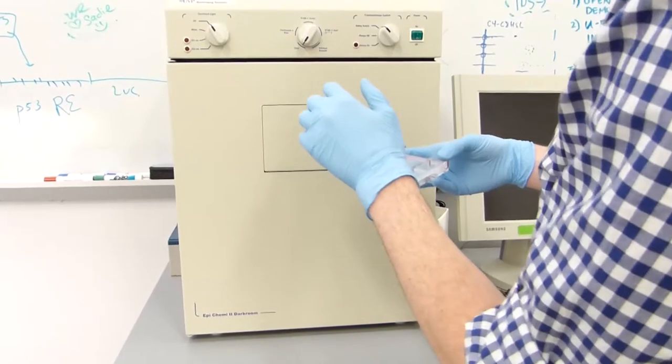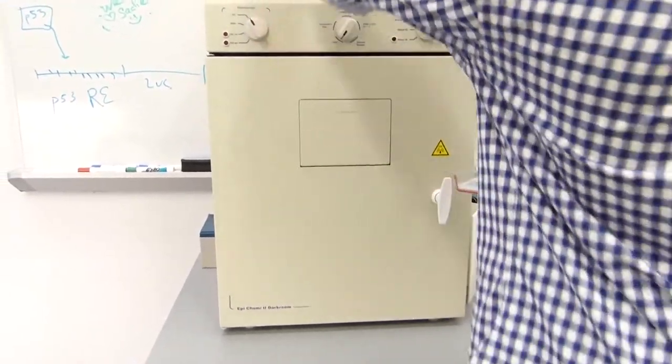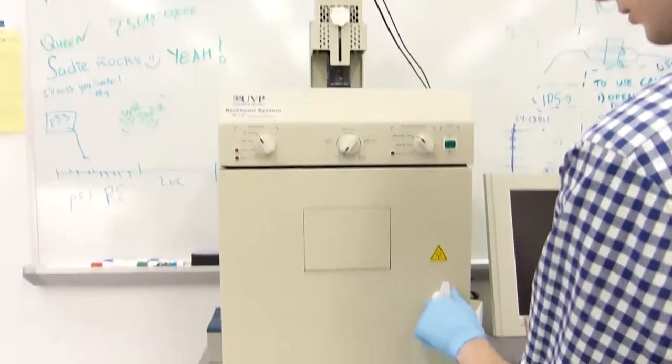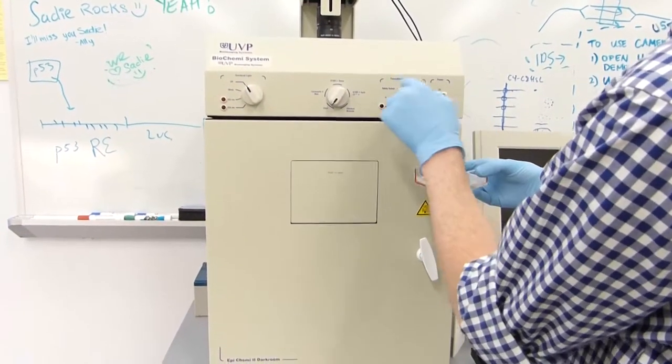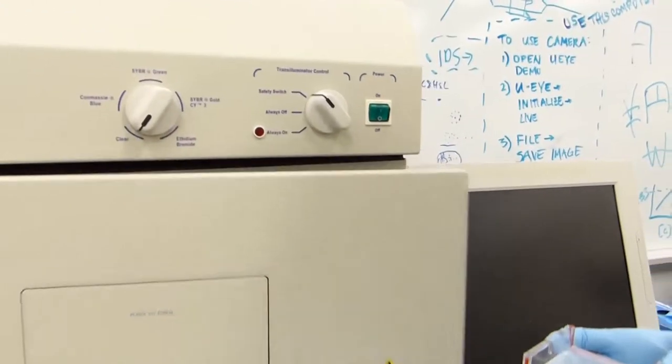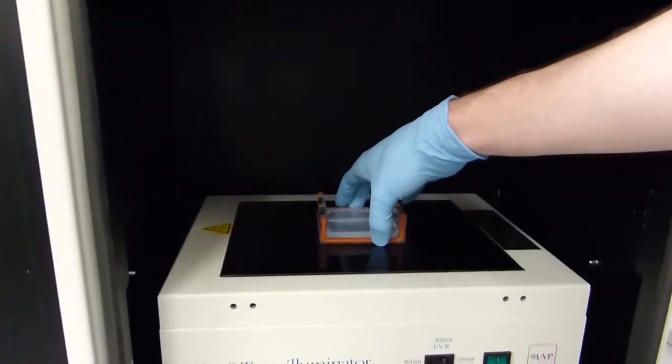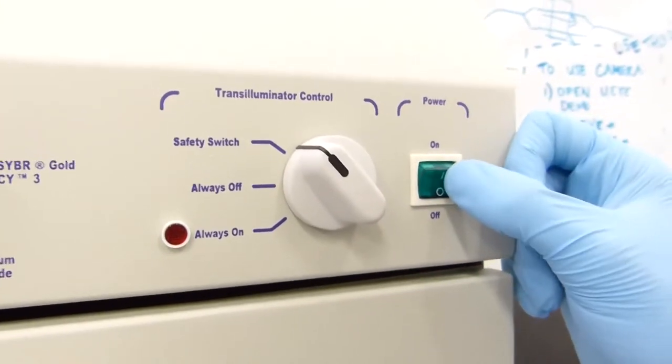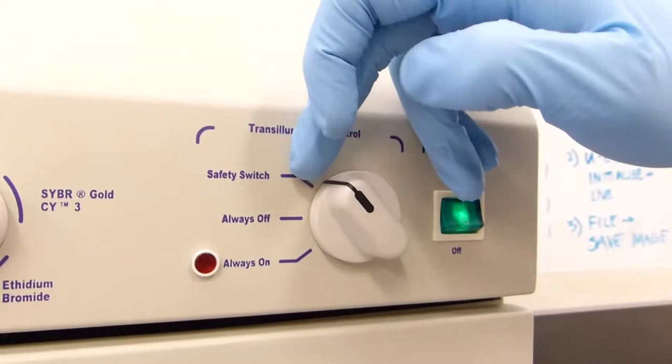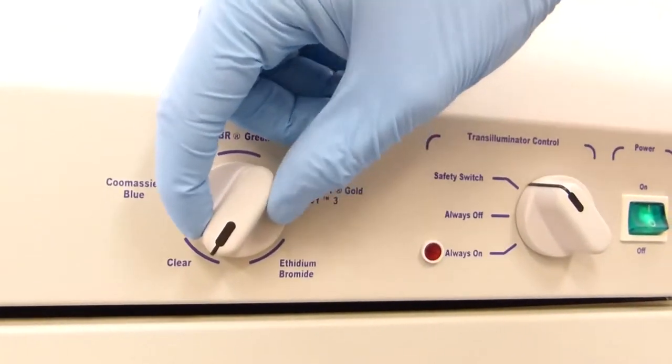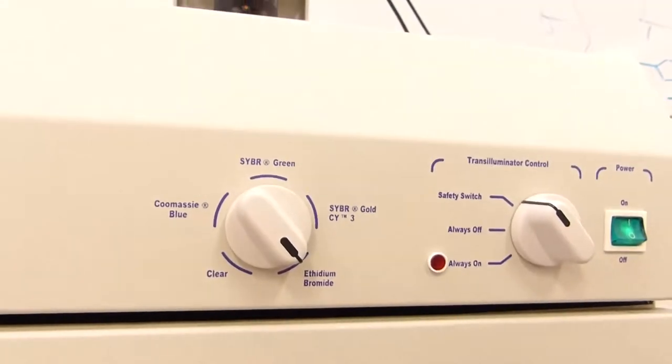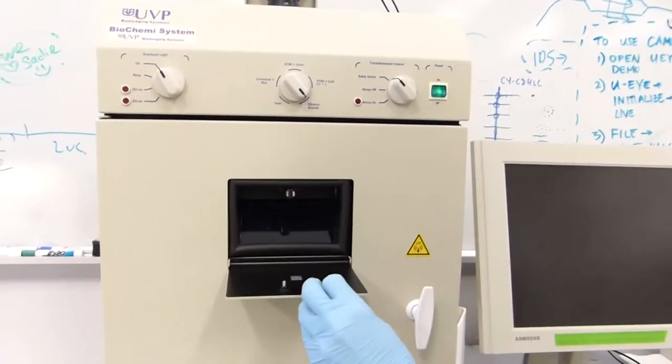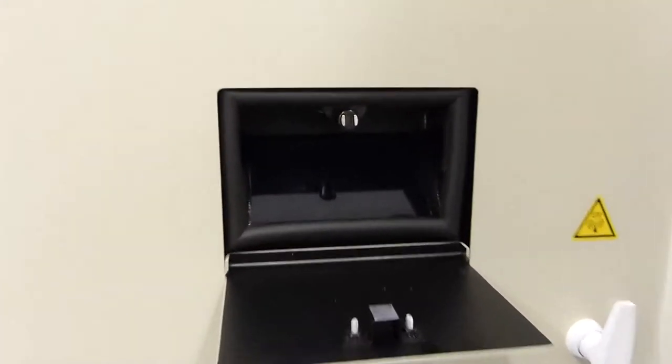We now move over to the UVP fluorescence box to image the gel. First, you turn on the switch at the top of the box and then open the box ensuring that this switch is off and this is on either safety switch or always off. You can then place the gel inside of the box, placing it somewhere near the center and rather even for imaging purposes. You can then shut the box, making sure to close the switch all the way and flip this switch to on. It is acceptable to leave this on safety switch and you want to make sure that this setting is on ethidium bromide as that is what we are using to image the gel.